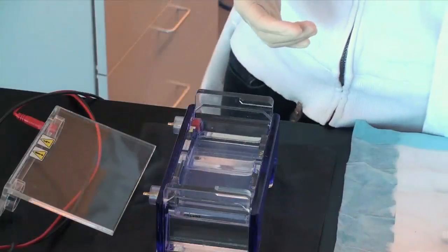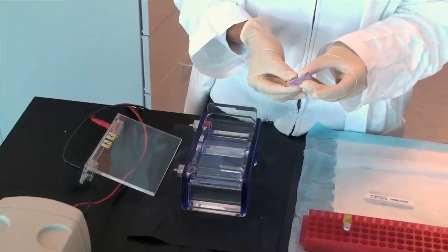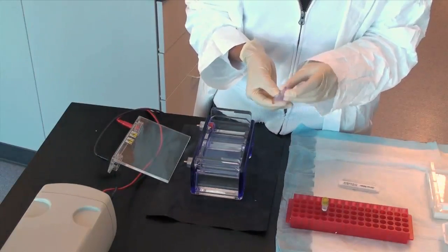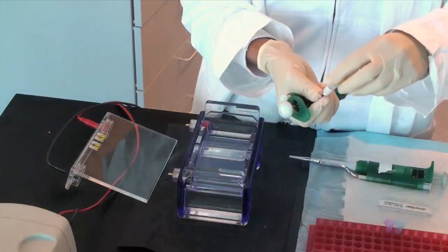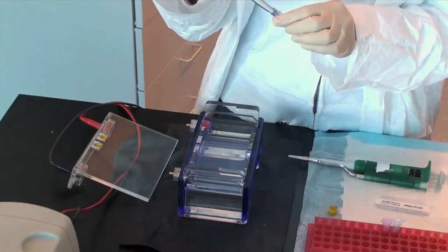Slowly load your DNA samples into the wells of the gel. Remember to add loading dye to each of your samples prior to pipetting them into the gel. The two most common loading dyes are bromophenol blue and orange G.